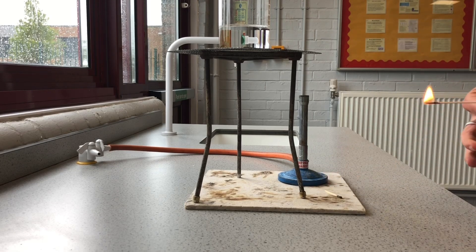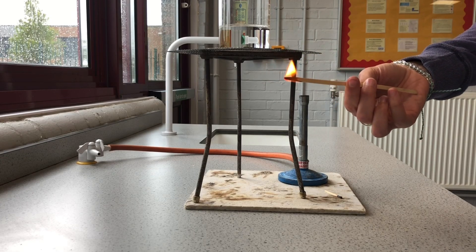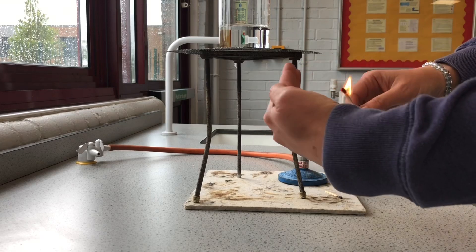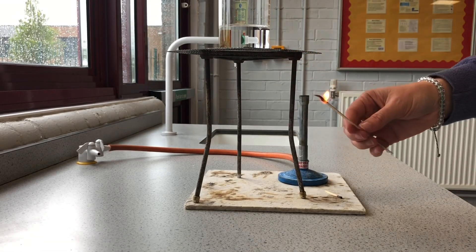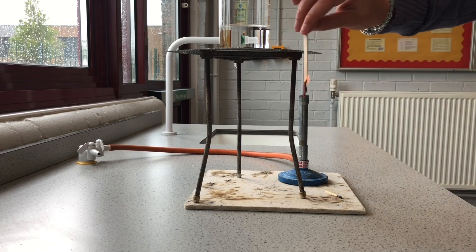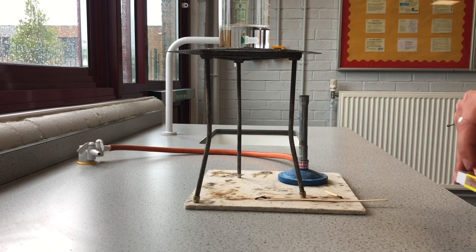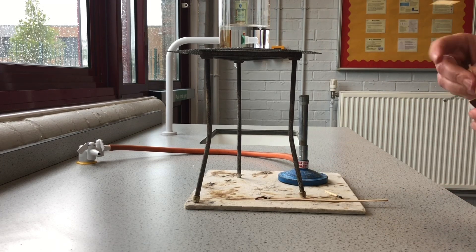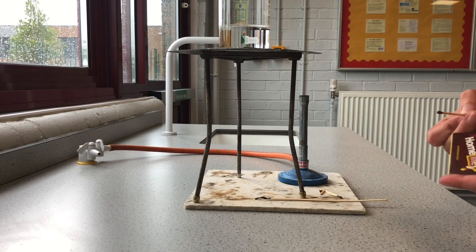We always use a splint — it's a piece of wood that we can use to light the Bunsen. We tend to walk around shielding it like this so we don't cause harm to anyone. If it looks like it's starting to go out, we can just dip it down a bit. That can quite often happen in science — just try again.